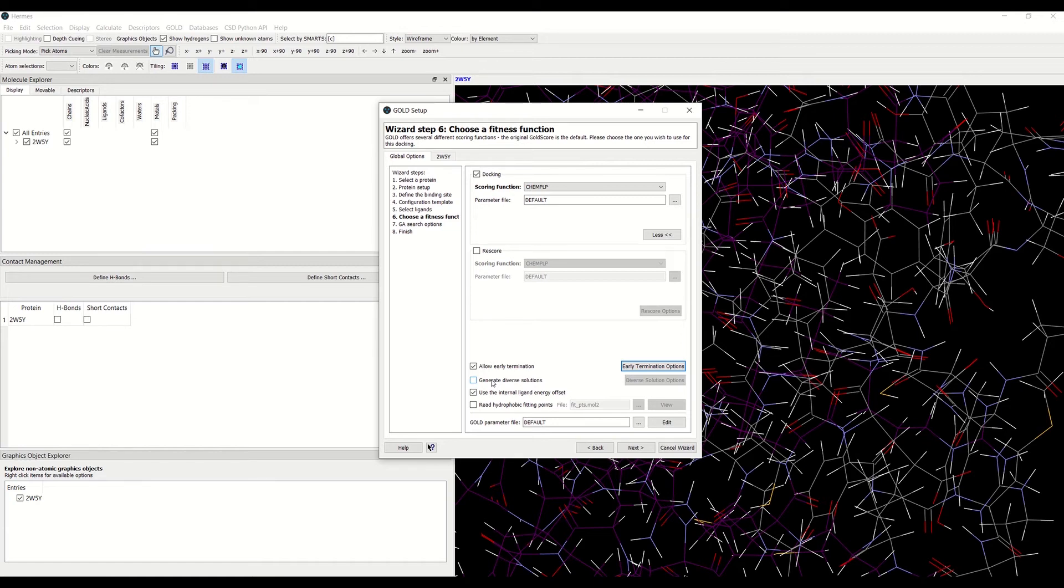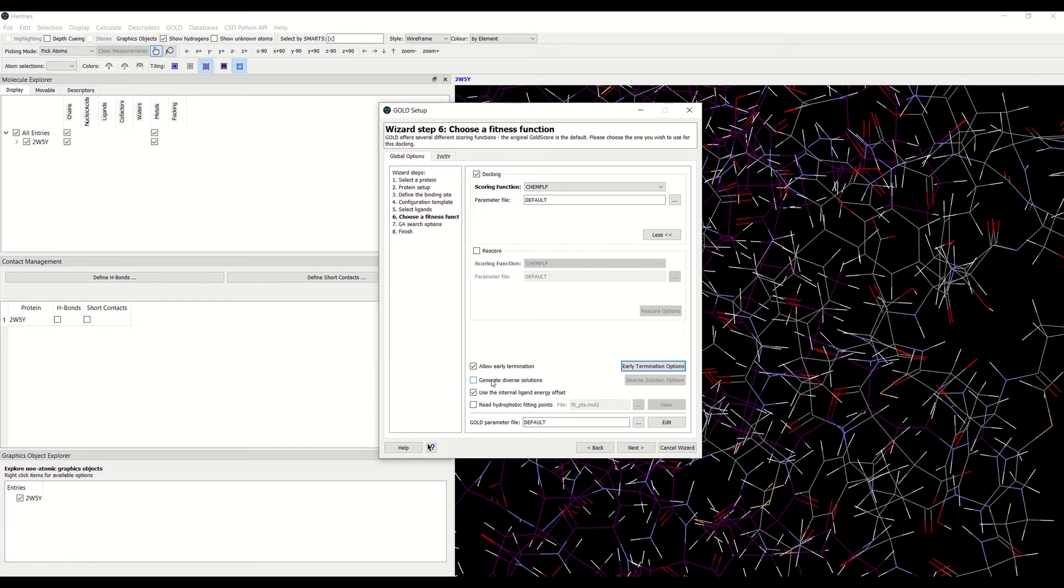If this happens, GOLD can be set up so that a number of different, diverse solutions can be generated. Therefore, the diverse solutions option dialog enables the following two criteria to be specified.